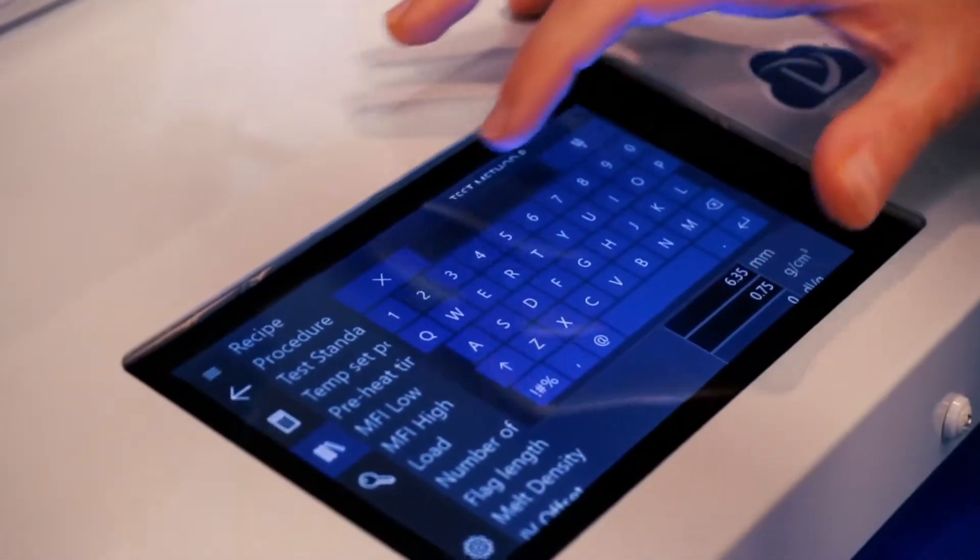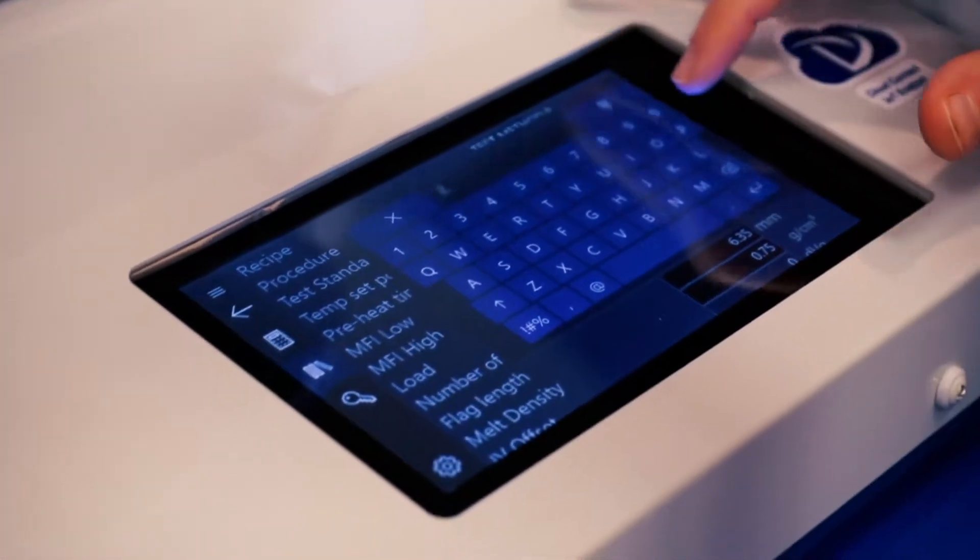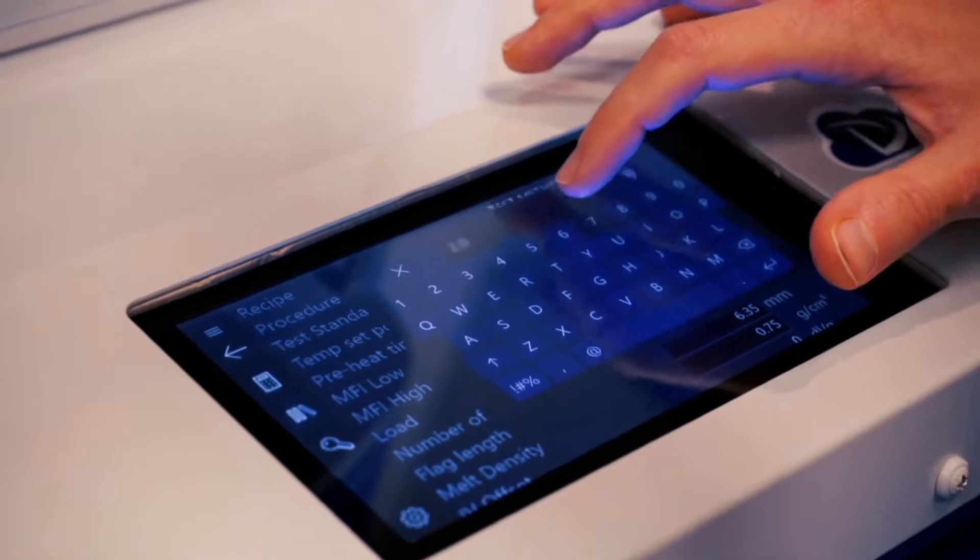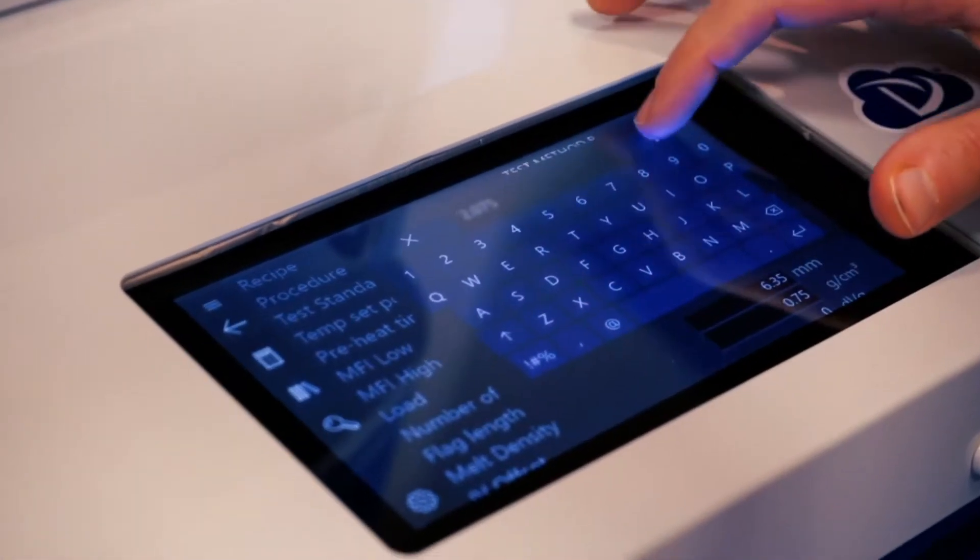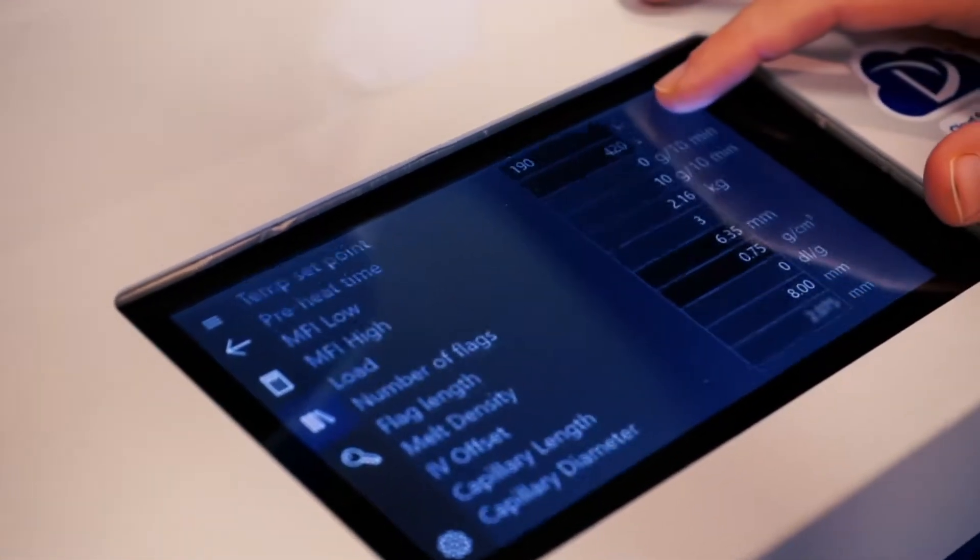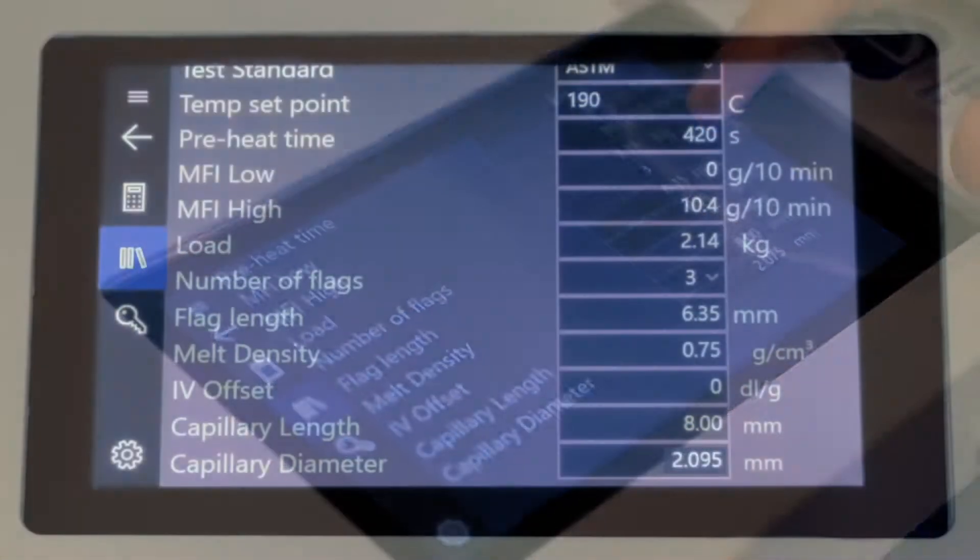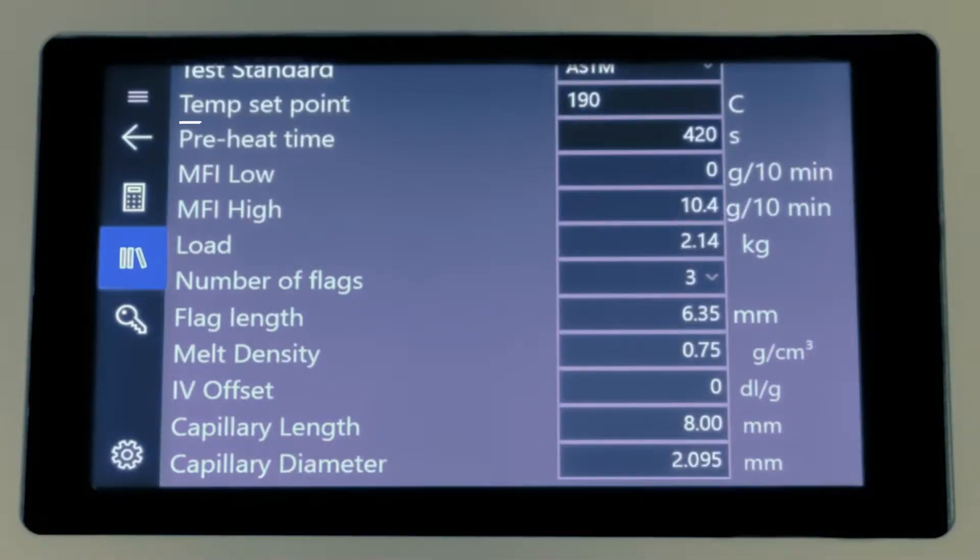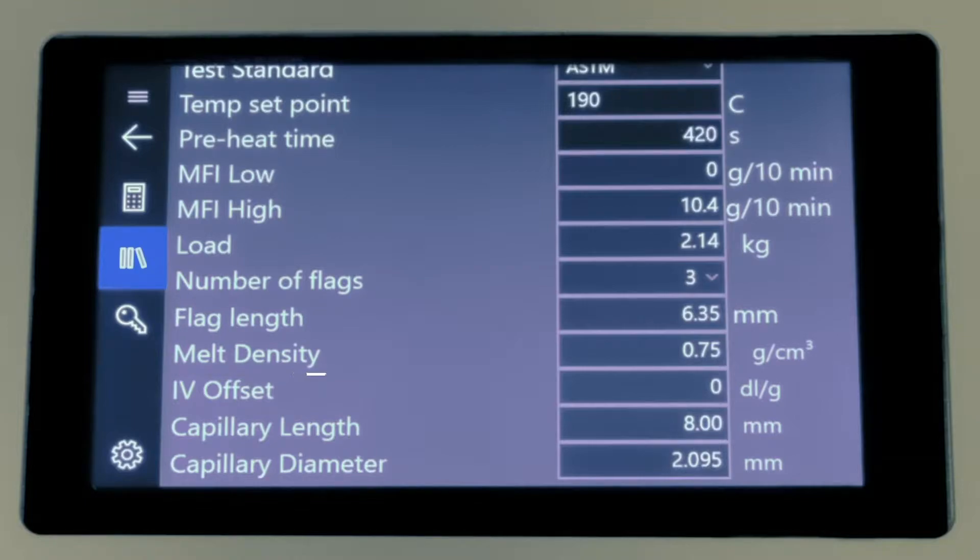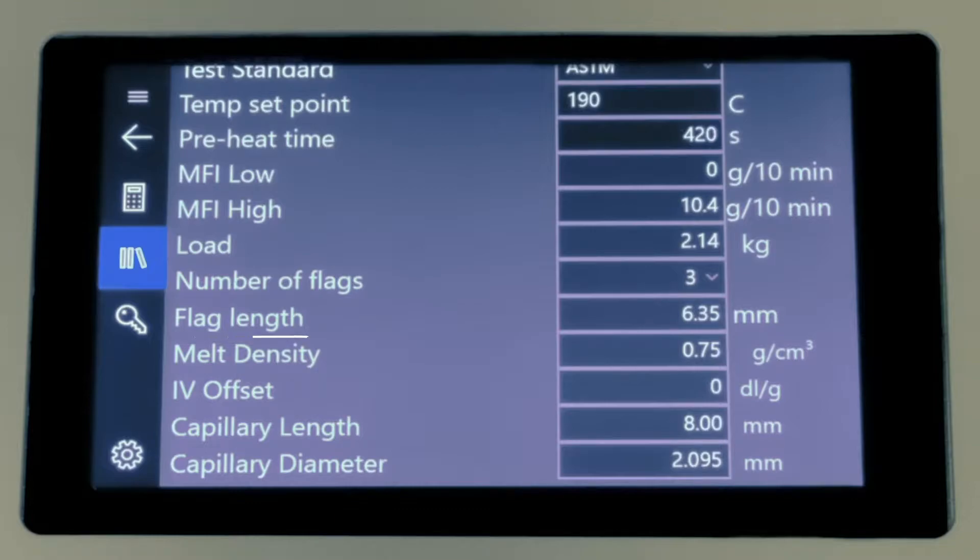First, the attendant sets the test parameters according to the relevant ASTM standard or the supplier specification for the polymer. The temperature set point will determine the temperature the polymer is melted at. Melt time determines how long the polymer will be melted for. The melt density number that was obtained with the prior Method A-B testing is entered, and the appropriate flag length or distance for travel is selected for the digital encoder.